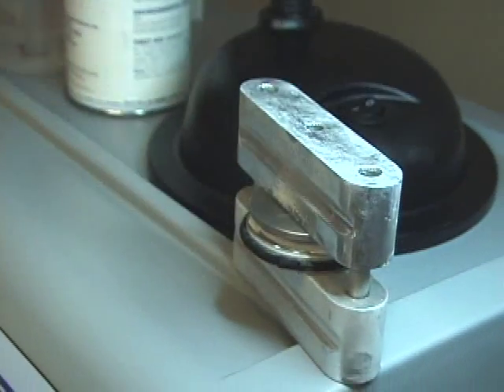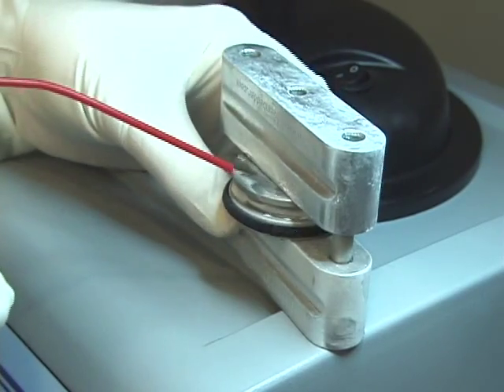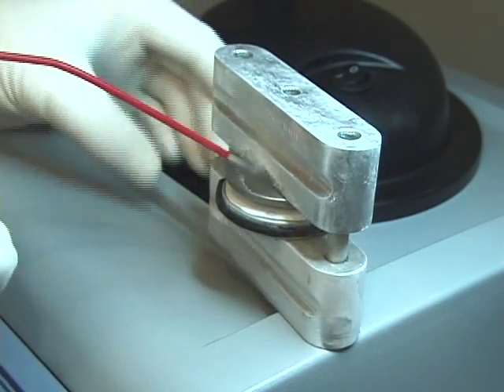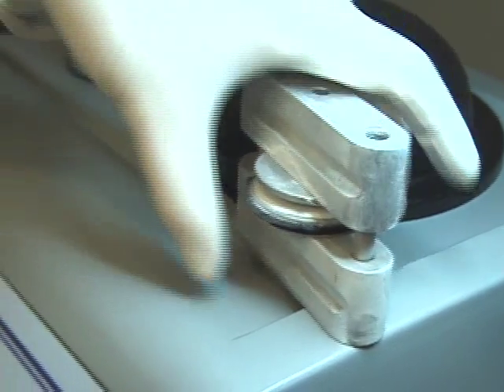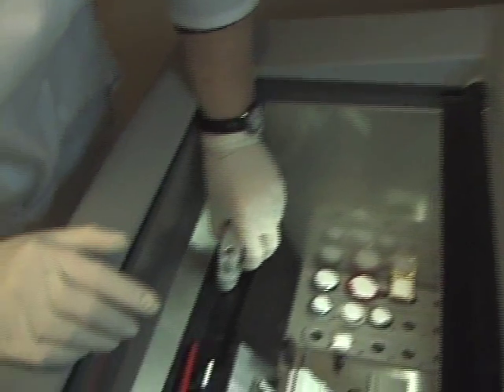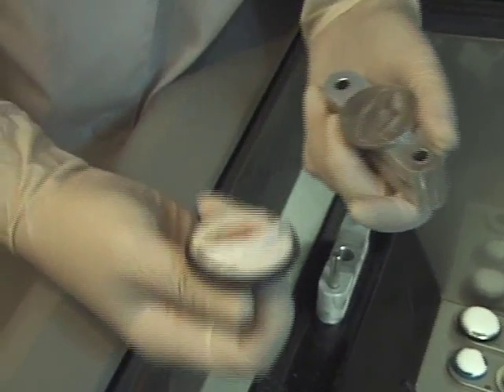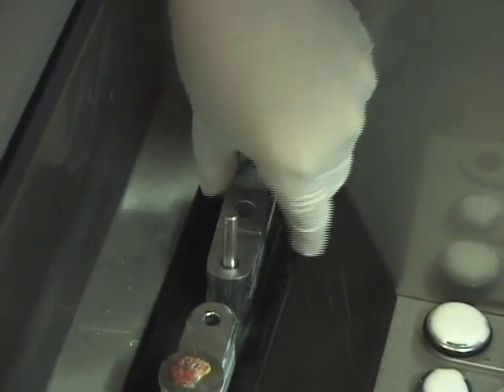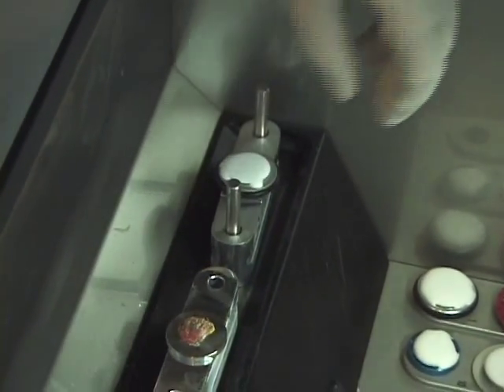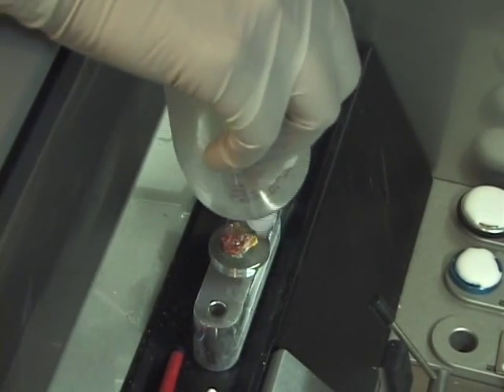The transfer of temperature through the metal disc into the tissue will not cause crystal artifact, as sometimes happens with tissue that is dipped into liquid nitrogen or sprayed directly with freeze spray. The Leica adapter works with both the regular and the large Leica chucks. The cryoembedder never needs replacement parts — the same discs are used over and over again and washed clean with water.